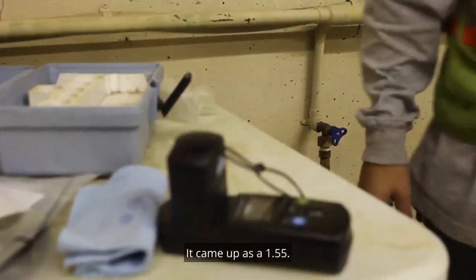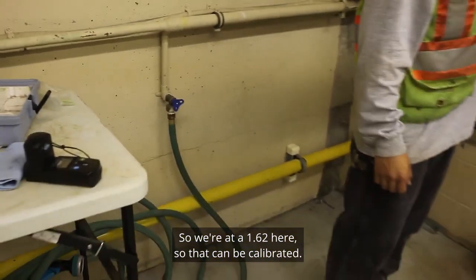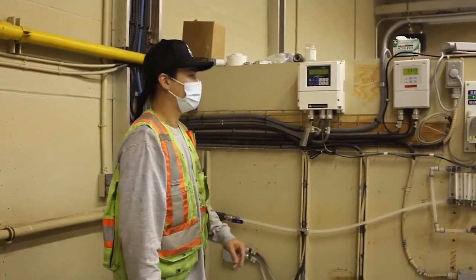The test came up as 1.55. The analyzer here is reading 1.62, so that needs to be calibrated.